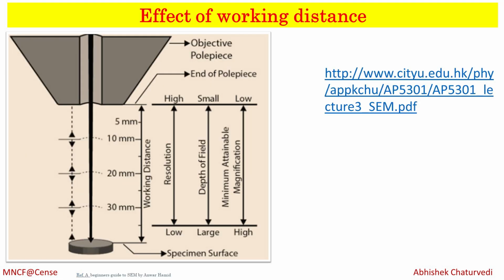right? Similarly, the effect of working distance. As you can see, we can have the objective or pole piece. Here you can see the working distance. If you increase the working distance, you can have a large depth of field but poor resolution. So you have to keep these parameters in mind.